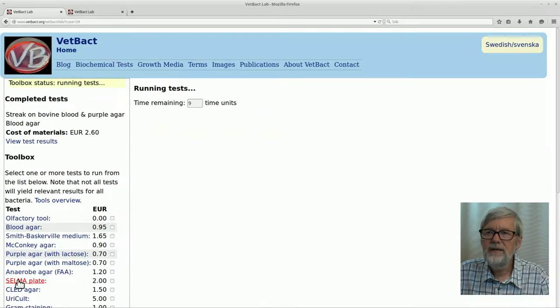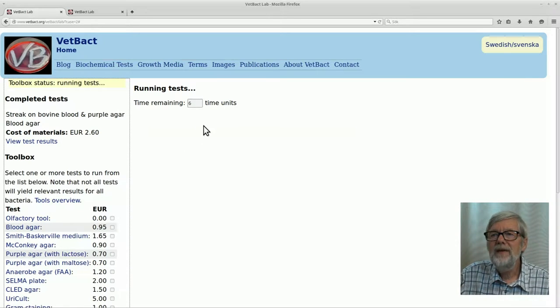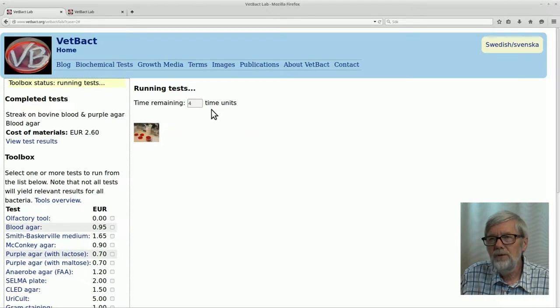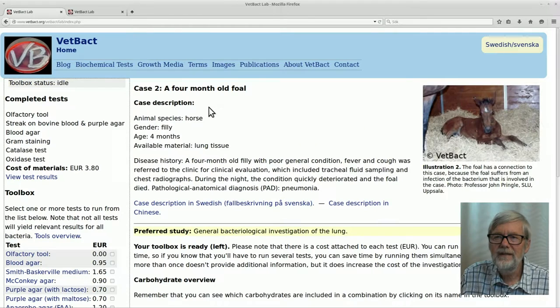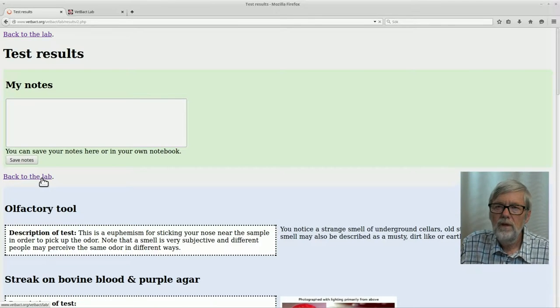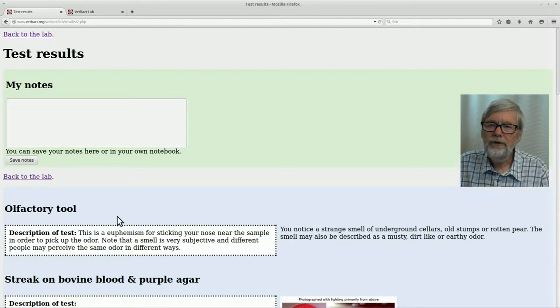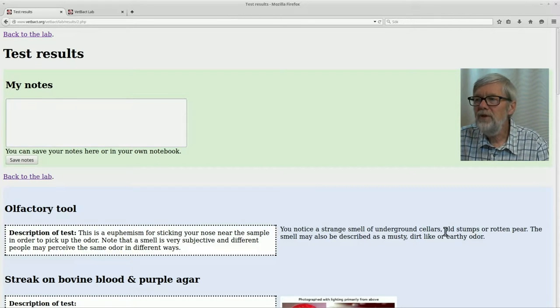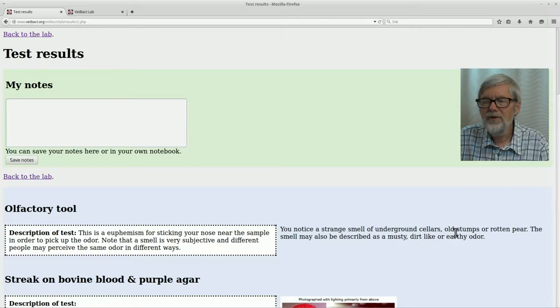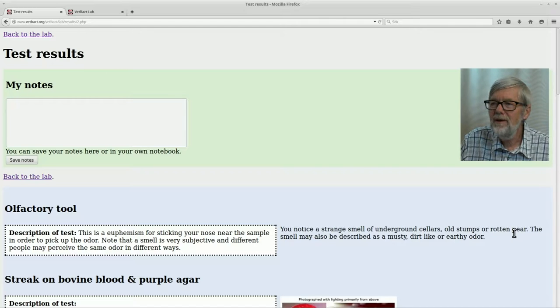Let's run the tests. It will take some time proportional to the real time each test takes. Now it is ready and you can view the results. Let's go down and check the olfactory tool. There is some strange smell from the bacteria, described as the smell of underground cellars, old stumps or rotten pier, which is in fact characteristic for these bacteria.